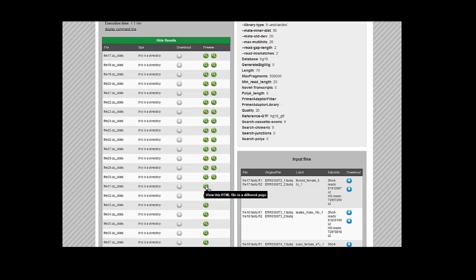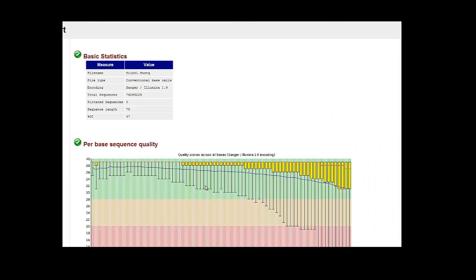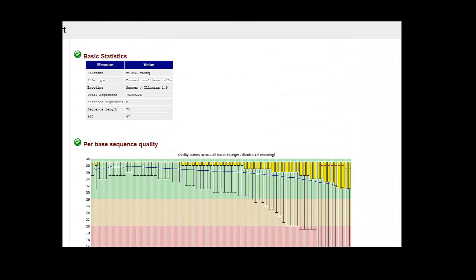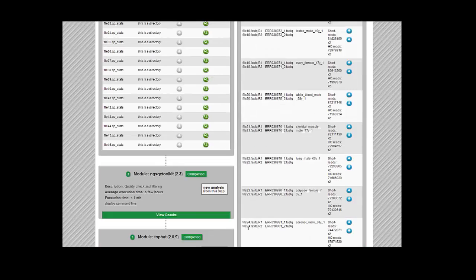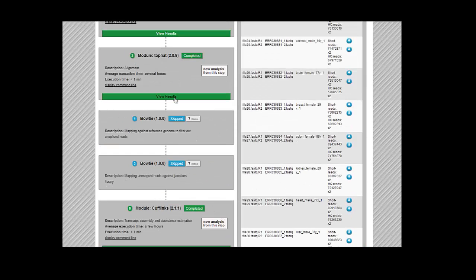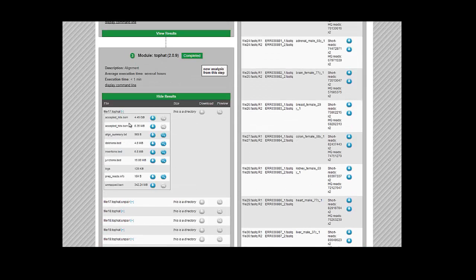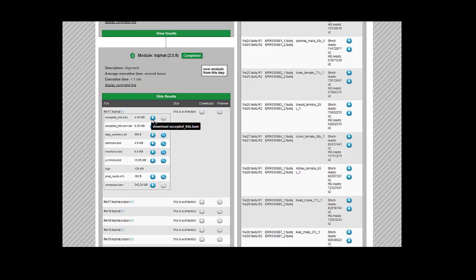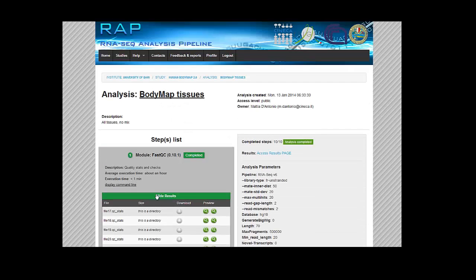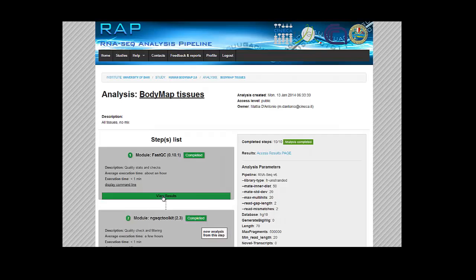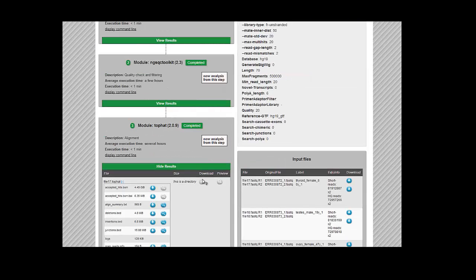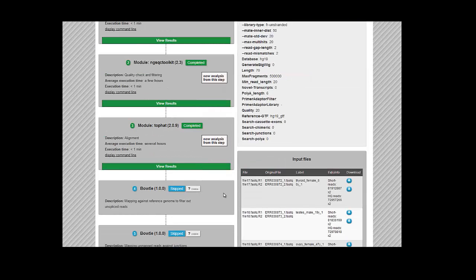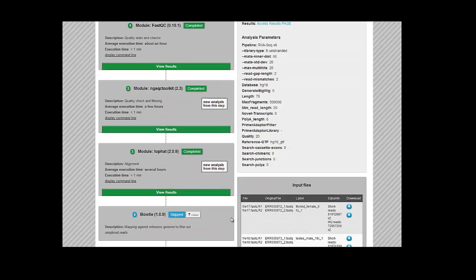So clicking here, I'm going to go to the quality checks, or I can click on the top folder to download the BAM files if I need to do further inspection by myself. But we're going to see more on this in the tutorial about the results section.